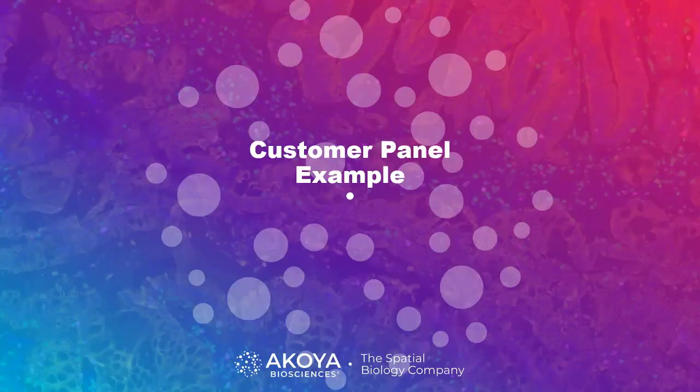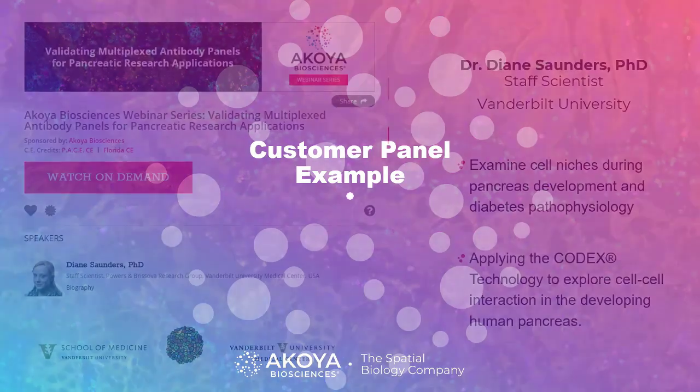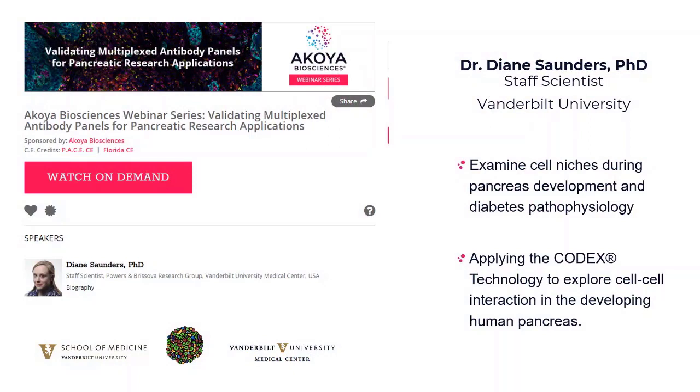During the last section of my talk, I will describe a panel designed by one of our wonderful CODEX users, Dr. Diane Saunders of Vanderbilt University. Her experimental goals are to examine cell niches during development and diabetes pathophysiology, and she is using the CODEX technology to explore cell-to-cell interactions in the developing human pancreas.